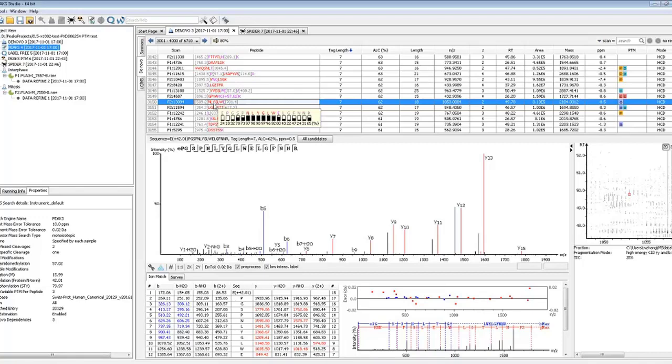So that's why you actually need to consider the local confidence when looking at a de novo sequencing result. As you can see here, we can't actually get ions that are showing fragmentation between the E, P, and G and the low or the high mass region, so we can't actually get the B or the Y ions that distinguish between these amino acids. So PEAKS is actually letting you know that really all we can do is guess at the amino acid sequence there. We know that there's some sort of amino acid sequence that's 509.2 Daltons, but we can't be entirely sure what that is.